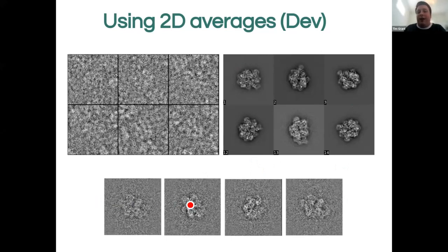So these are our constrained faux images where we have just taken random subsets from these class averages of 5 to 10 images. It's a tunable parameter you can change. And we make sums of them. So these sums now have considerably higher signal to noise ratio than the images that you had in the first place. And then we just run the whole process again.